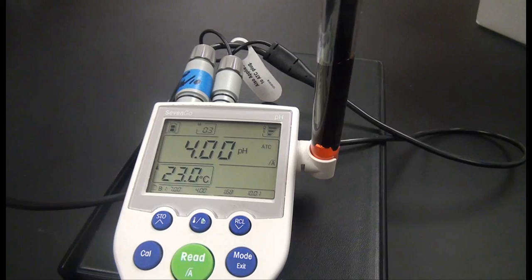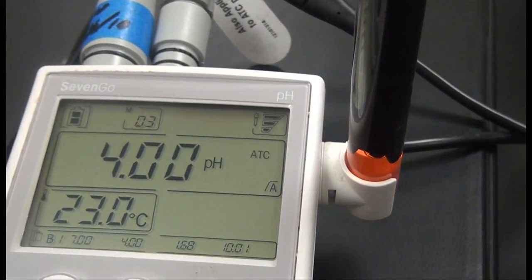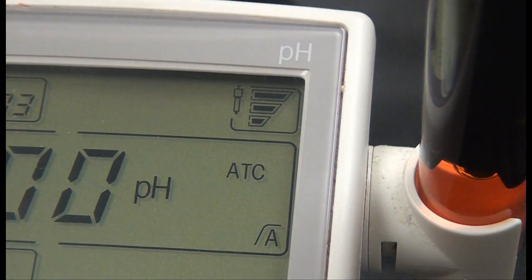The 7-go-pH meter continuously measures electrode condition. A bar indicator on the upper right of the meter display screen shows the current electrode condition. When the graphic displays three bars, the unit is in good condition. At two bars, the electrode is in need of cleaning. And one bar indicates the electrode is faulty and in need of replacement.